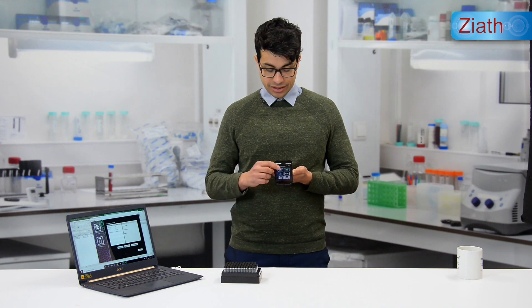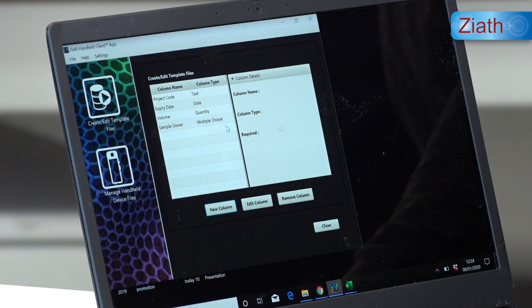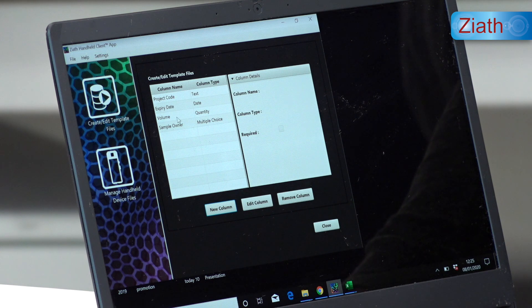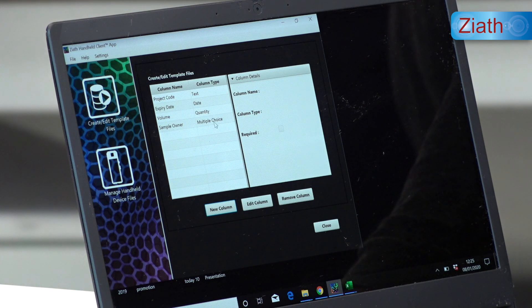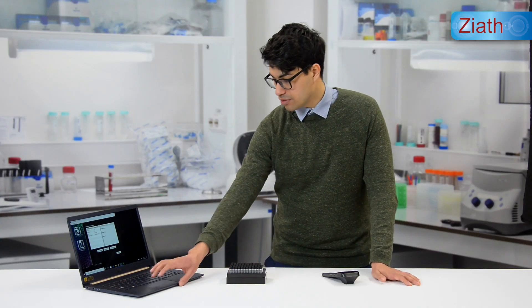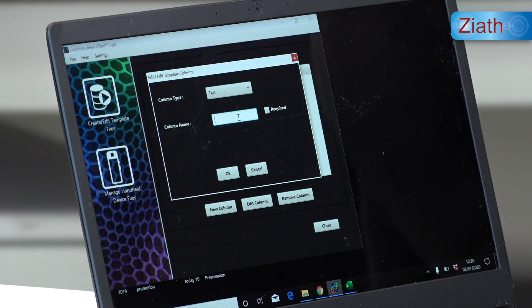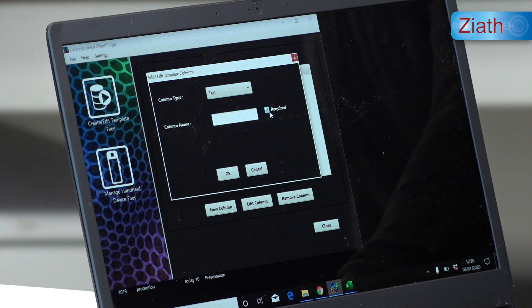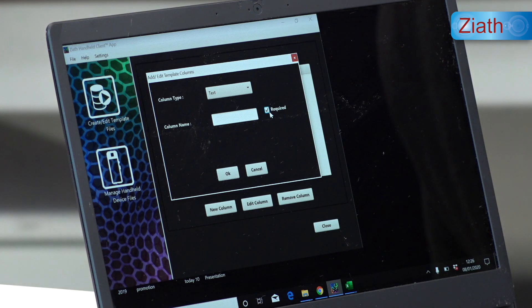Now I'm going to explain what the add and edit data function does. We must first place a template that we create using the handheld client onto the handheld. To create a template, we use the create and edit template files application. Here I've created an example template which contains the fields: project code, expiry date, volume, and sample owner. The handheld client can create different parameters for the data — these are text, date, quantity, and multiple choice. The field can also be set as required, meaning that field must be included when sample data is added.